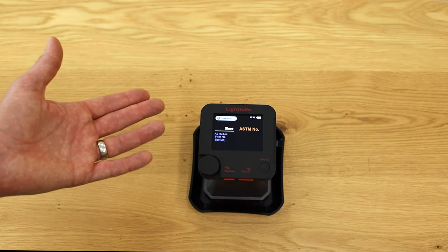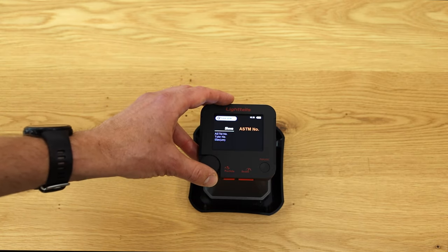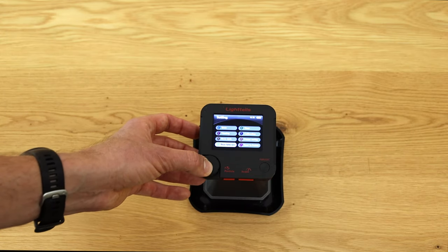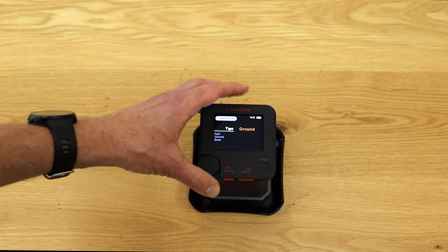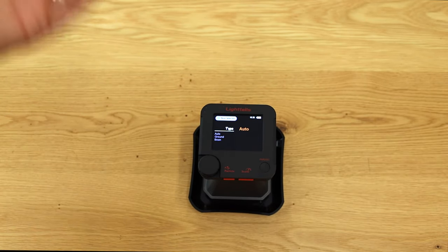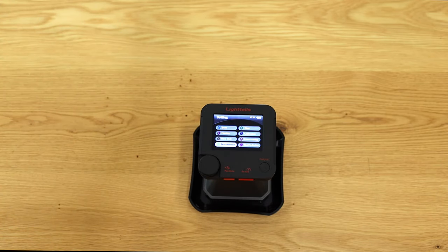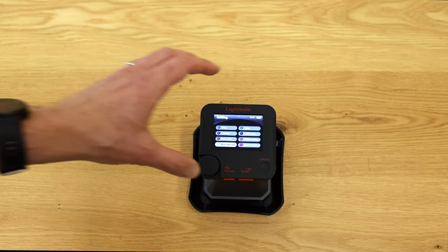There is a sieve style setting for particle distribution measurement — you can choose ASTM, Tyler, or Size; we'll go with Size here. Bean selection lets you preset whether you are measuring whole bean or ground coffee for color metering, or you can set it to auto mode and the device will detect it automatically. This works pretty well, so you can leave it on auto. If a measurement seems off, you can manually preset ground coffee or whole beans.